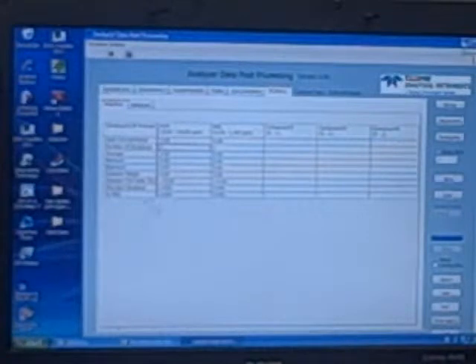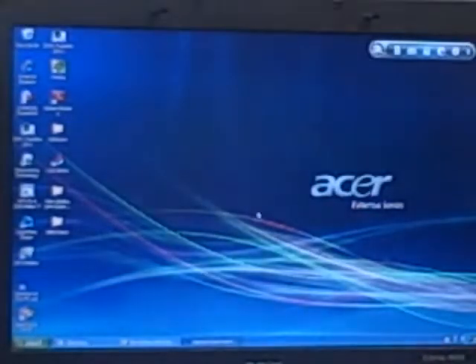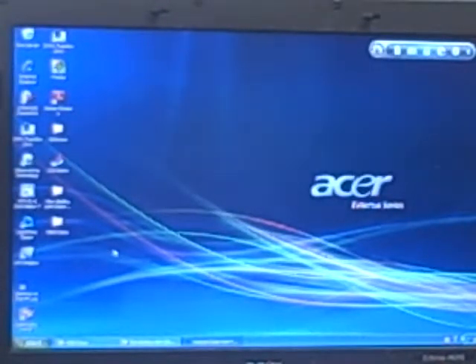That means you want to send the data to us for a remote diagnosis to help you. Okay. With this data, we will be helping you as if we were in front of the machine. Now you want to find the raw data where it's saved. So you click this icon. For example, I saved it in this place, so I remember it. And the data is called test2. You want to send the data to us, so we will be able to help you.